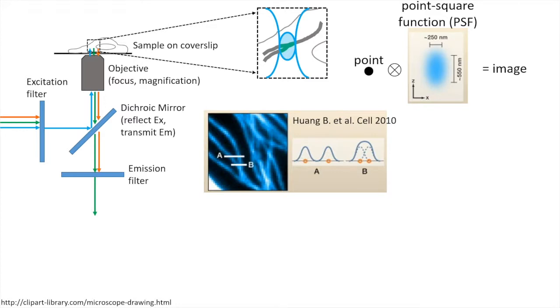This is the idea of the diffraction limit, which Greg also mentioned a little bit in his presentation. Generally, the definition of the diffraction limit is wavelength over 2 times numerical aperture, or you can simply think of it as half of your wavelength. With our current optical system, we cannot image better than this diffraction limit.